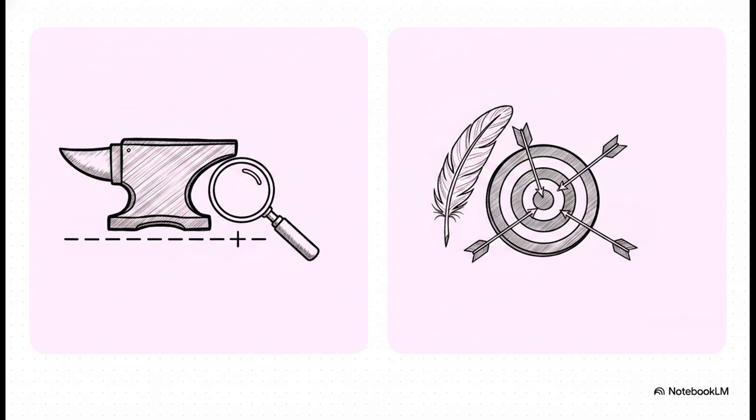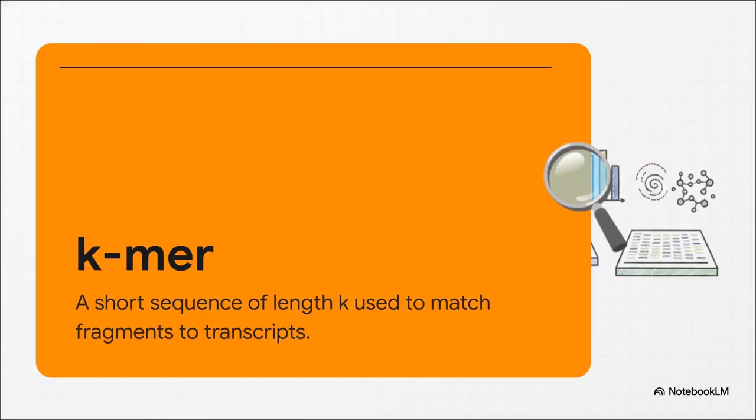And it's not just the guide that differs, it's how we use it. Traditional alignment-based workflows are computationally heavy. They try to pin down the exact genomic coordinates where a read maps, explicitly dealing with those messy spliced junctions. On the flip side, we have modern alignment-free workflows. These are what we call lightweight and fast. Instead of agonizing over exact coordinates, they use probabilistic models to simply ask, hey, which transcript is this read compatible with? These modern lightweight approaches pull this off by using something called K-mers.